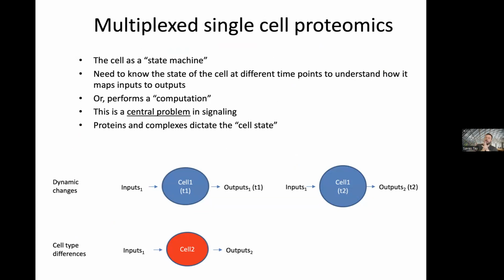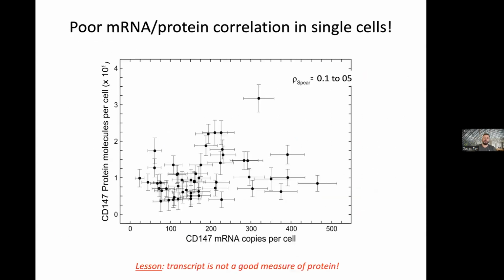It's a proteomic technique. And the reason why we developed this technique is, again, we want to be able to do computation and understand how cells are processing information. They take inputs, create outputs, and there's something in the middle, right? The middle is the machinery of the cell, and we want to be able to model this. To do that, we have to have good data, and getting good data requires, in this case, a new technique, because mRNA measurements that could be produced by, for example, RNA sequencing will not solve this problem of having poor correlation between mRNA and protein.